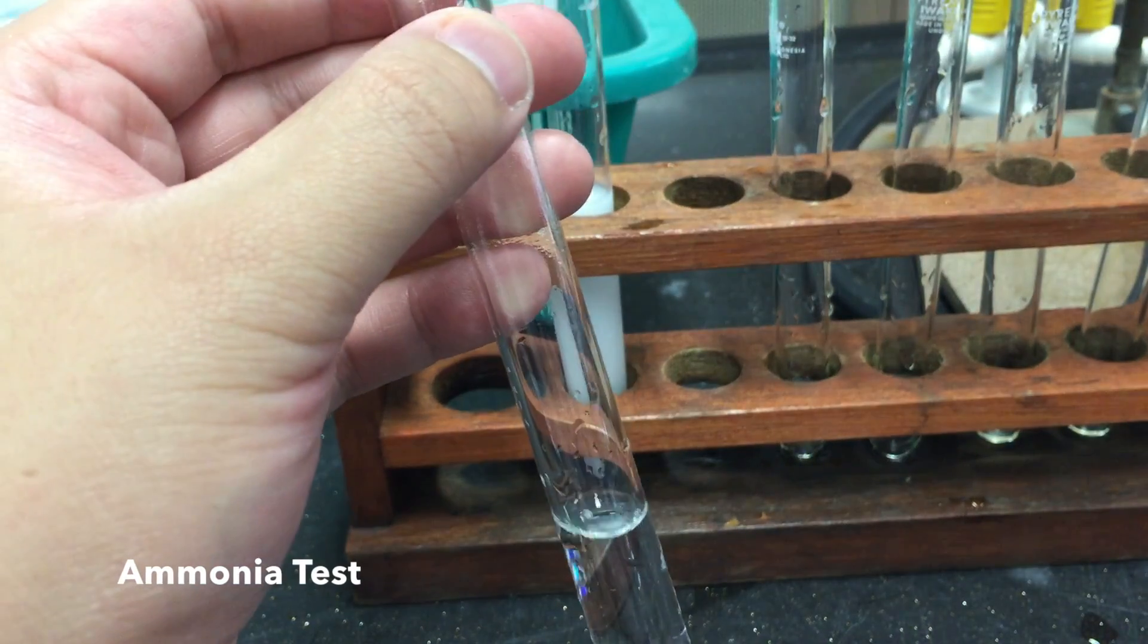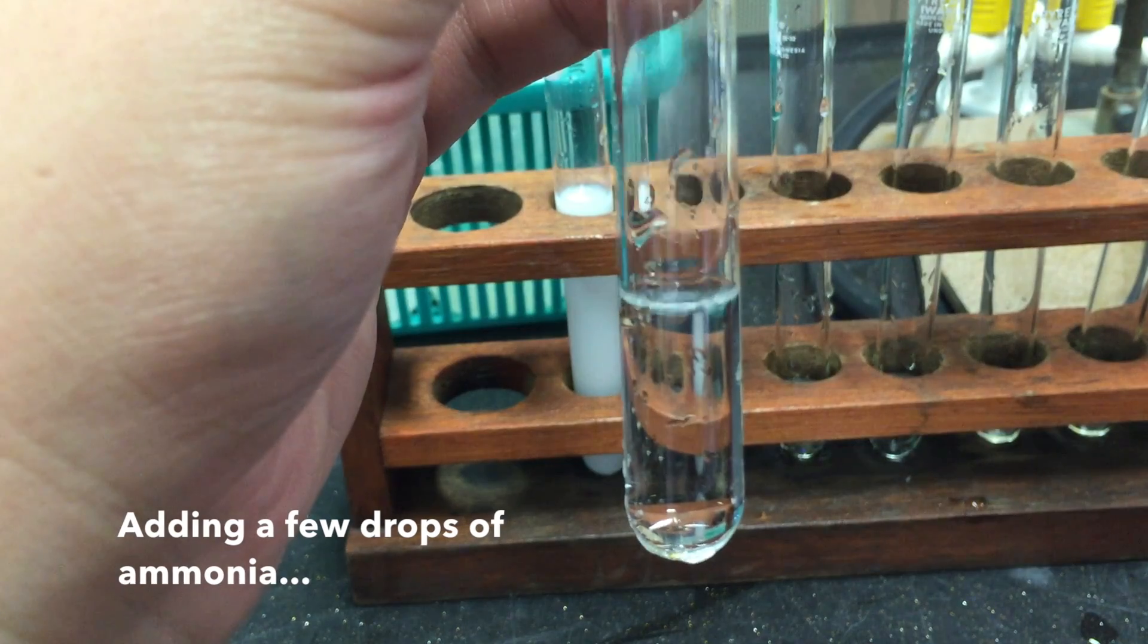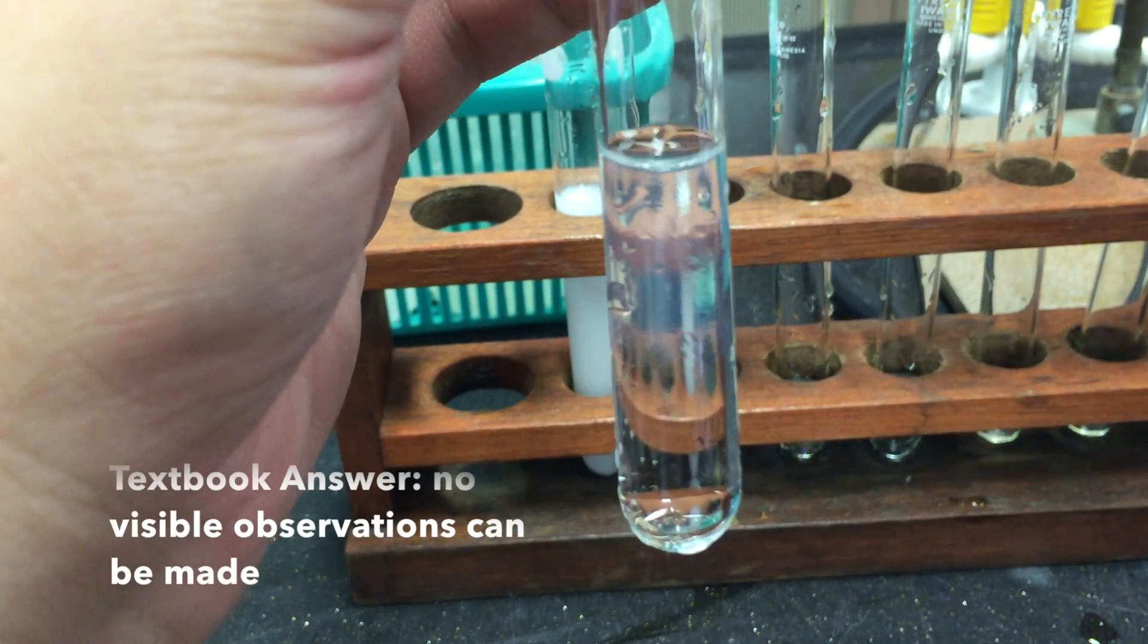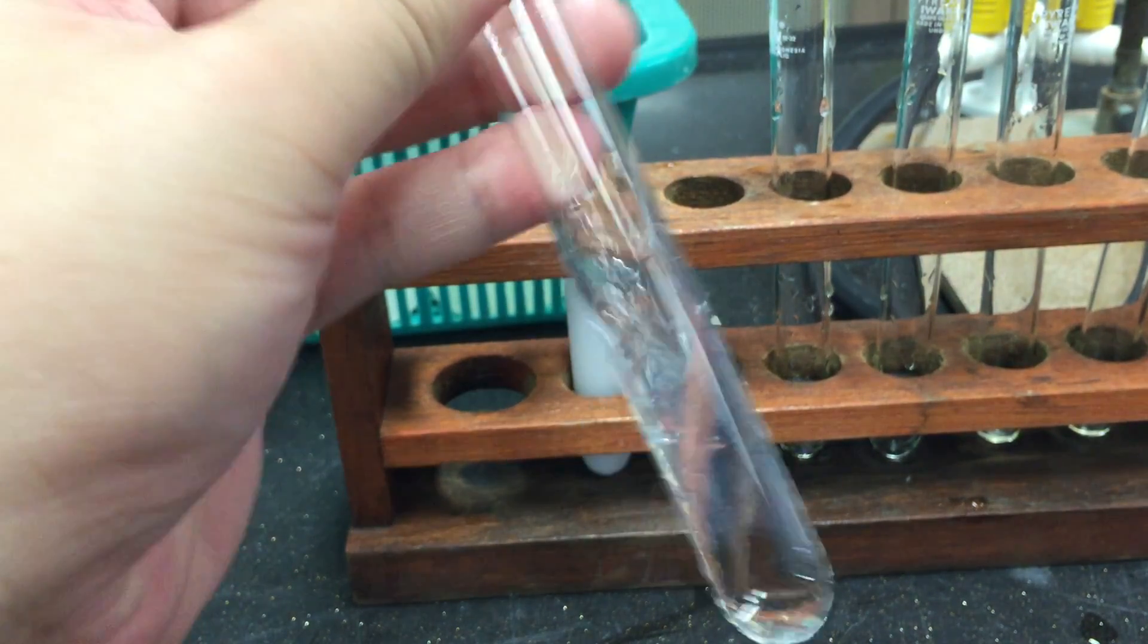Next up is the ammonia test. To a small sample of your solution, add a few drops of ammonia. According to the textbook, no visible observations can be made.